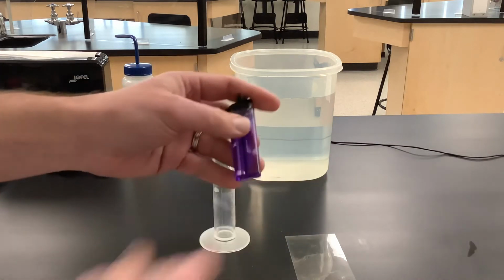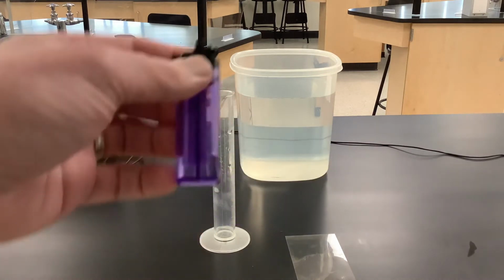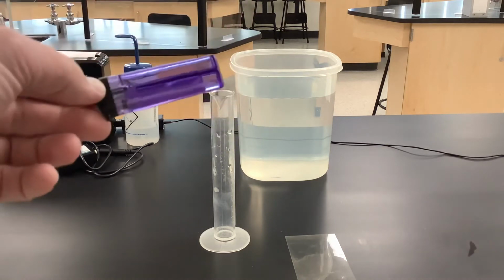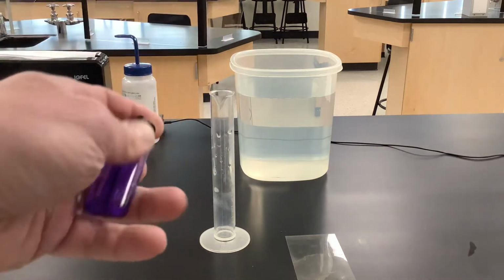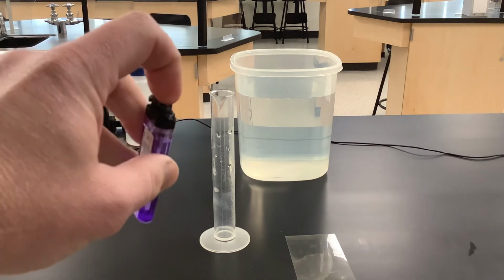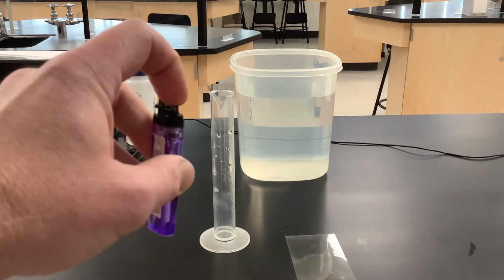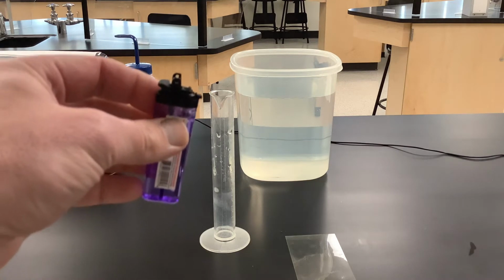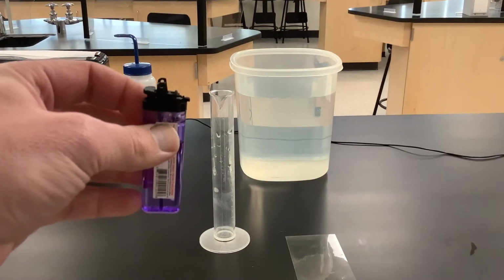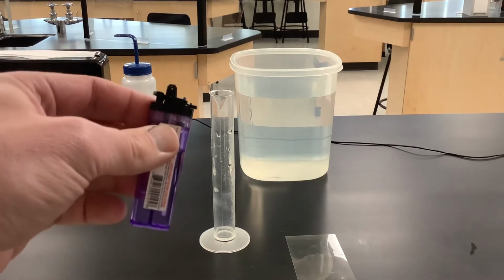When we're looking at the butane lighter here, if we hold it up, you can see the liquid inside. That liquid is the butane. The lighter looks a little bit funny because I broke the piece that actually sparks. But you'll notice there's a little valve right at the top, and that's where the gas will come out.